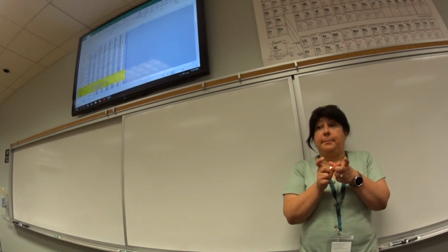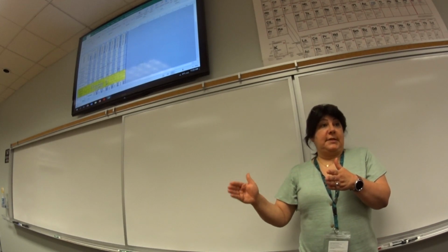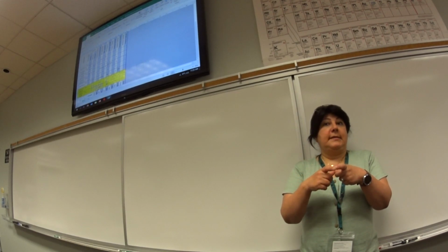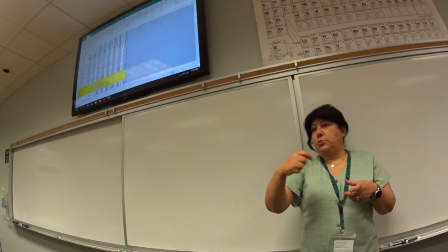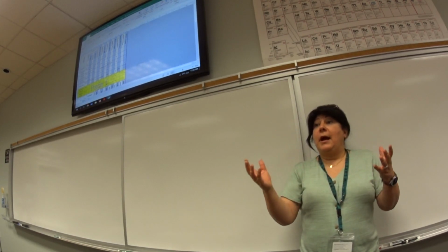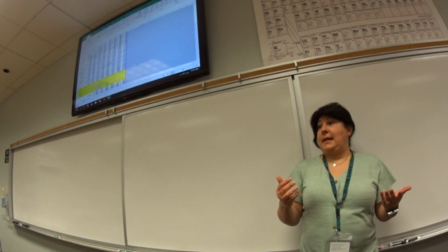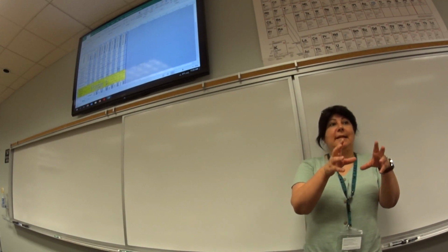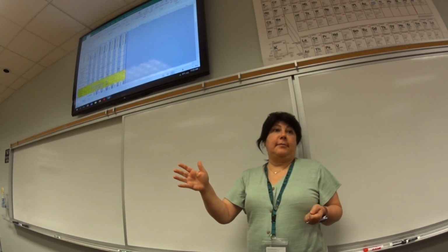I will give you guys a plate. These are the ones, she started growing them today. So you will get a fresh one on Wednesday. We will give you TSI or TSA plates too. What you're going to do on that plate, try to do a streak too, to make sure that you have a pure isolate. You're going to get it for Wednesday. We're going to transfer it to that, and as soon as that grows for 24 hours, I will take those out and put them in the refrigerator.